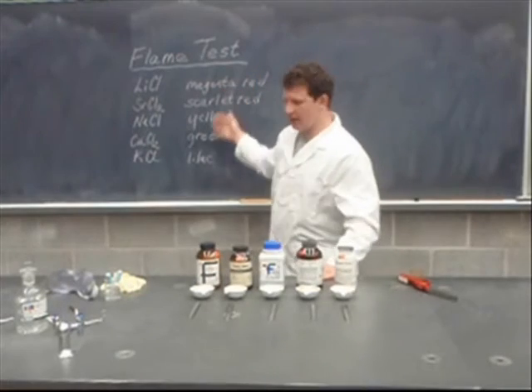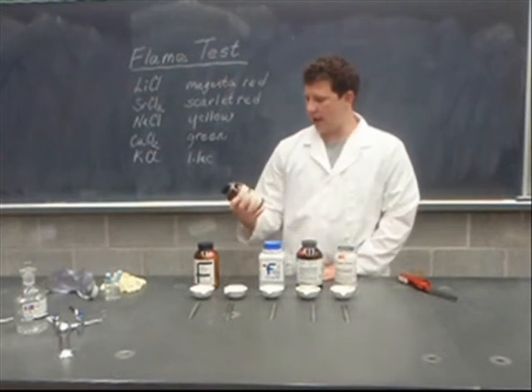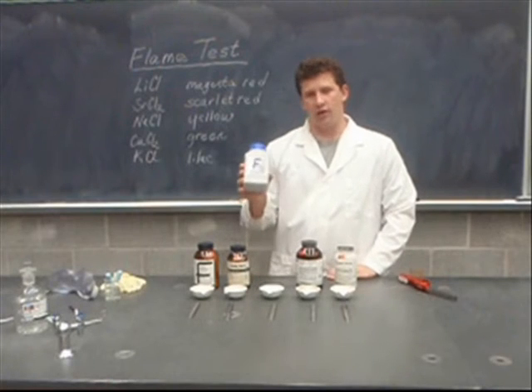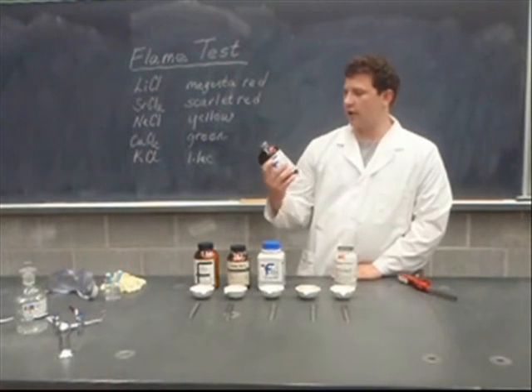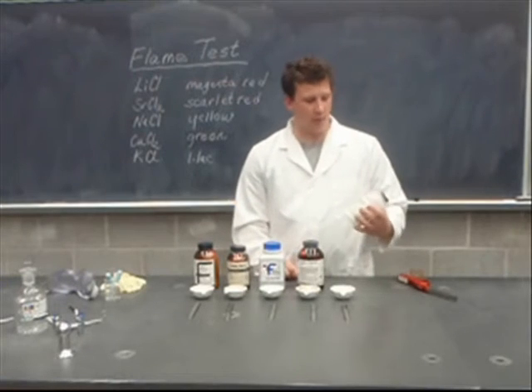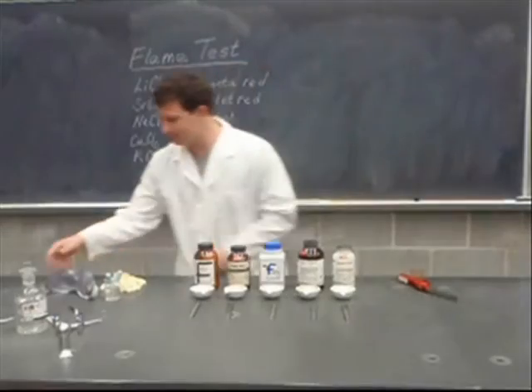The five metals right here, we have our lithium chloride. It should burn a nice magenta red. We have our strontium chloride, which is going to burn more of a scarlet red. Sodium chloride should burn a nice yellow. Our copper chloride, which is going to burn a greenish blue. And our potassium chloride, which is going to burn a nice lilac color. For those of you who don't know, lilac is a shade of purple.